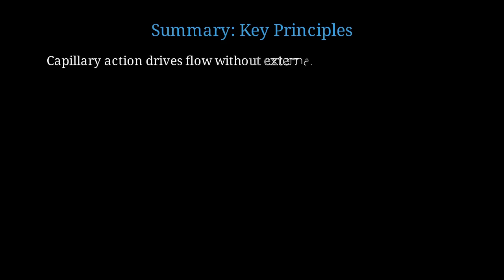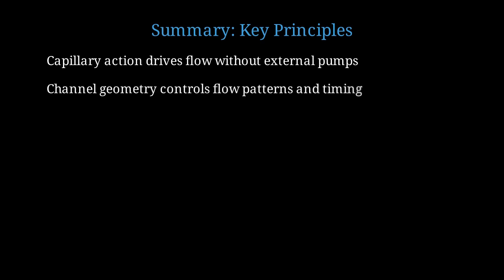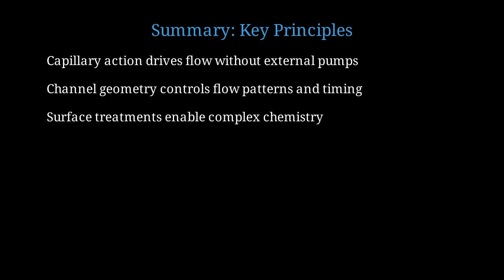Capillary action, driven by surface tension and contact angle, provides the pumping force. No batteries or external power needed. By engineering channel width, length, and connectivity, we control where fluid goes and when it arrives. Hydrophobic patterning confines flow, while immobilized reagents enable sophisticated biochemical assays in a simple paper substrate.